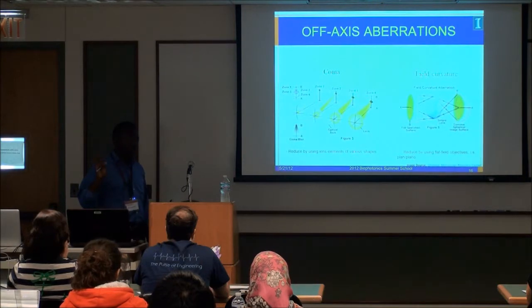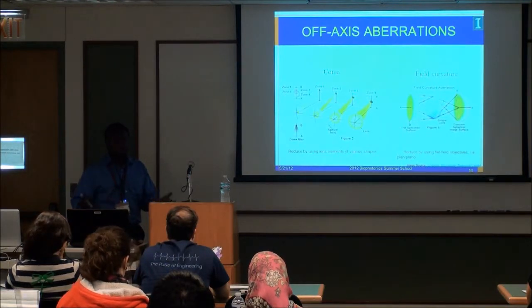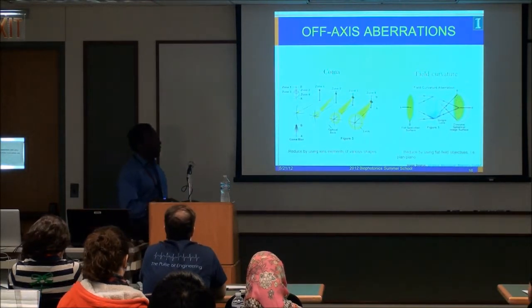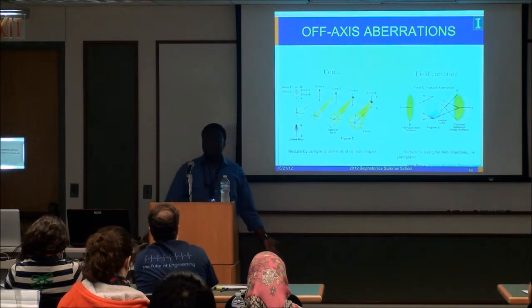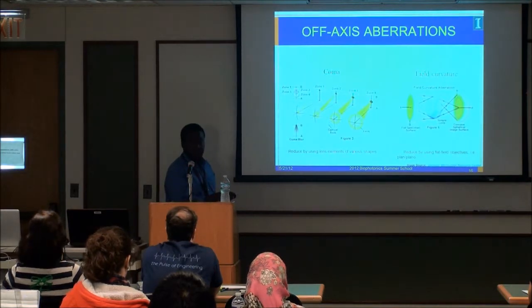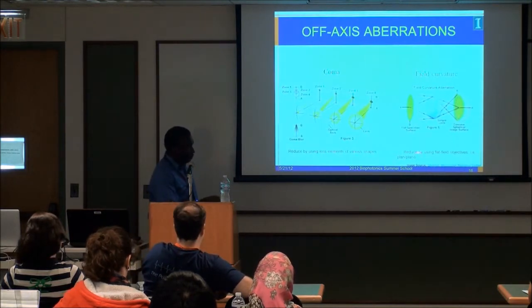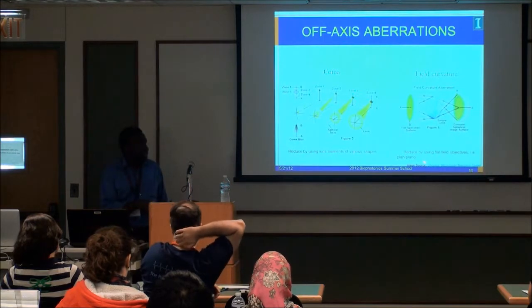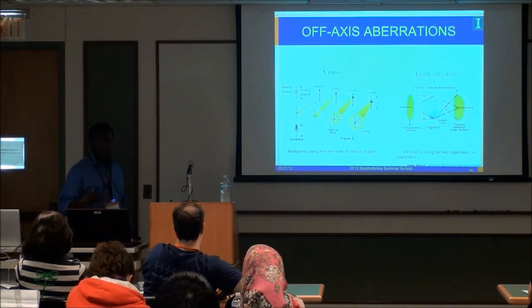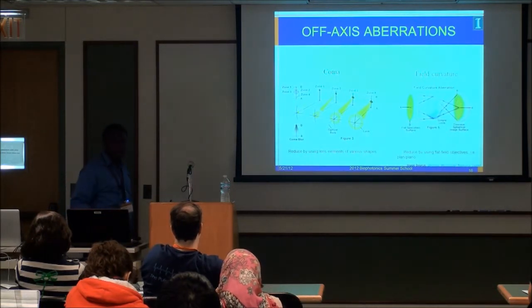Now people have, compared to maybe 100 years ago, very sophisticated ray tracing software that you pay a lot of money for, that allows them to put in these different lens designs to try to minimize some of these effects. Field curvature comes from having a curved surface. So what happens is if you want to get the light in focus, it may look sharp at A and not sharp at B, or vice versa. To try to get them sharp at the same place is hard. And so here, you again use tricks with shaping the lens. And typically when you buy an objective lens, which is what's used in the microscope, you use something called a plan or planar type of lens to correct for this effect. So for the most part, it gives you something that approximates a flat field.